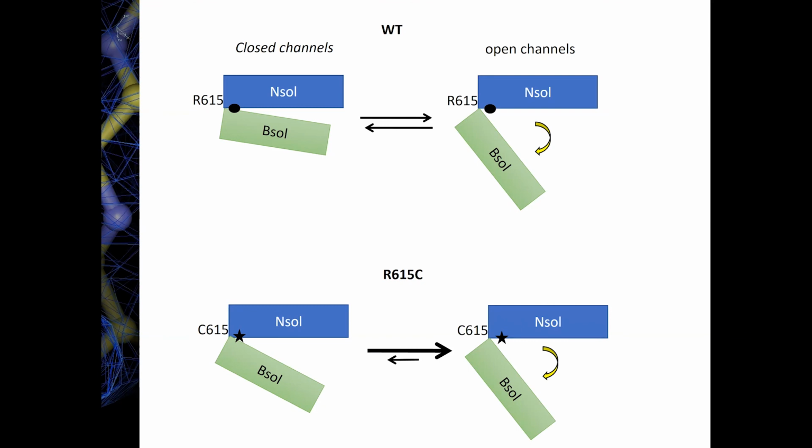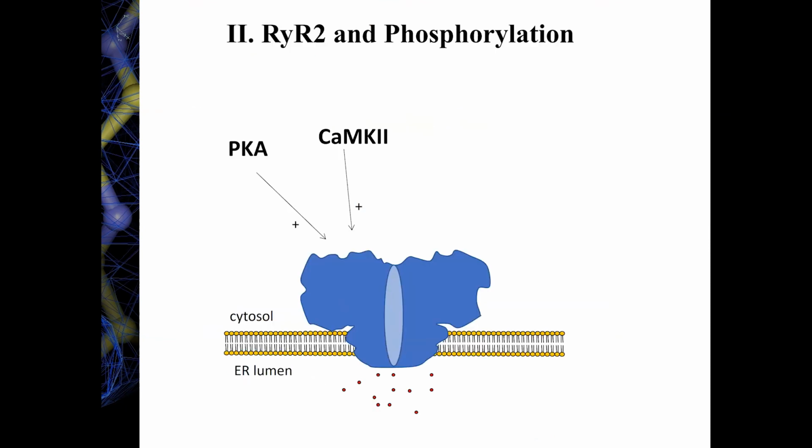Now, there are many more disease mutations in the ryanodine receptor, and I think many of those have their individual stories, and there will be a lot to be explored via cryo-EM. But I also pointed out that post-translational modifications also play a role in disease. And so what I briefly want to talk to you about is what we figured out about kinase regulation of cardiac ryanodine receptors. So in the heart, the main isoform is RyR2.